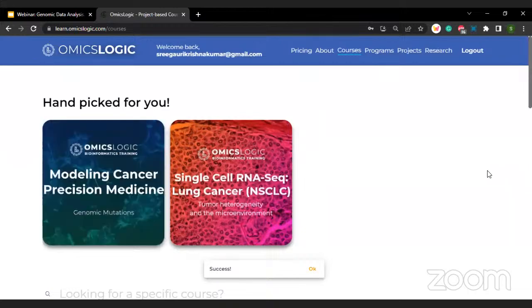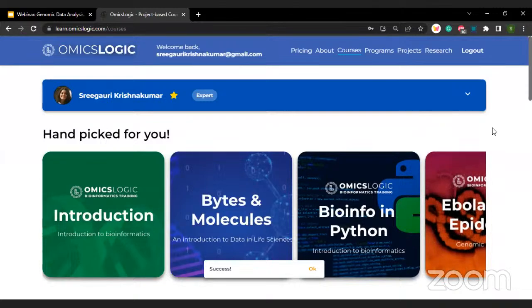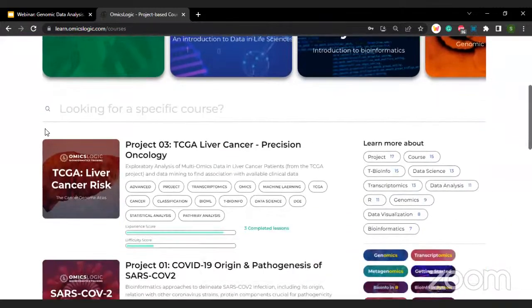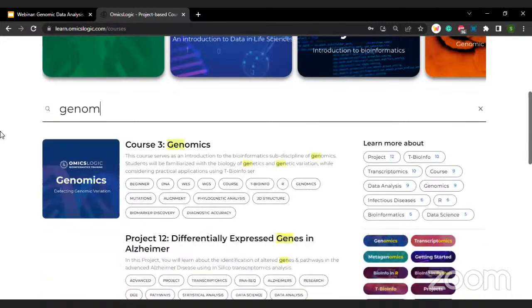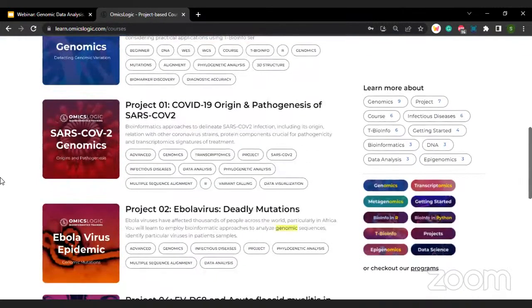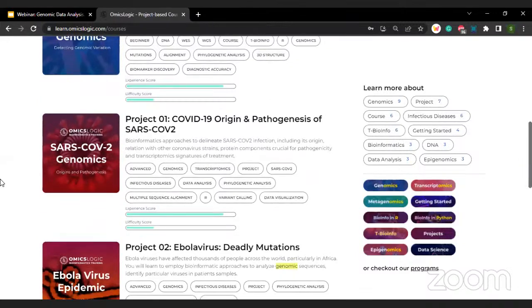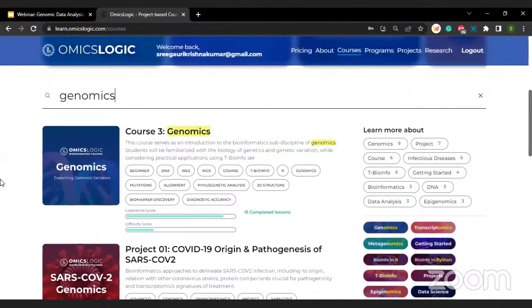Once you sign in, you will be landing on the courses tab. Here you will have the opportunity to browse through various courses and example projects. Since most of you will be interested in genomics, type 'genomics' and you will be able to see a diverse range of topics, from COVID-19 to Ebola virus.